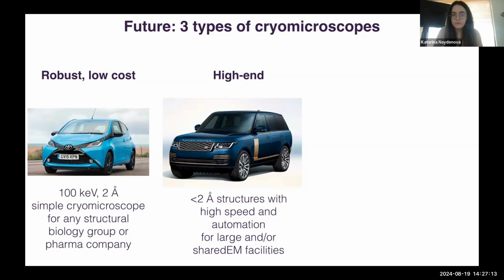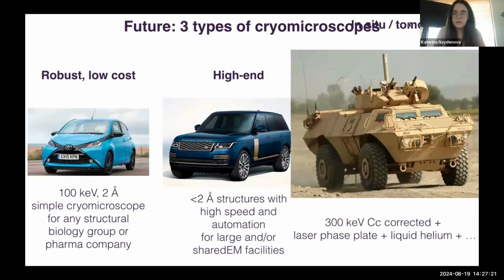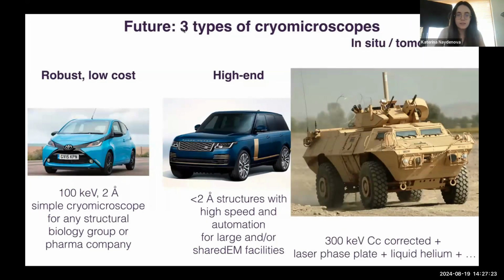They will be capable of reaching high resolution with more speed and more automation, but really an elite instrument. And finally, there will be a whole separate class of instruments for imaging cells and thicker samples, which require much more technological innovations than those simple instruments for single particle cryo.